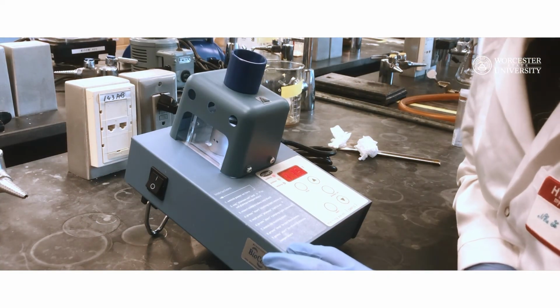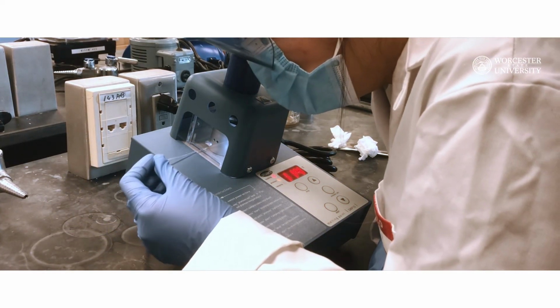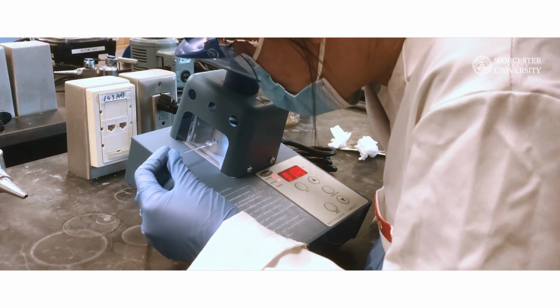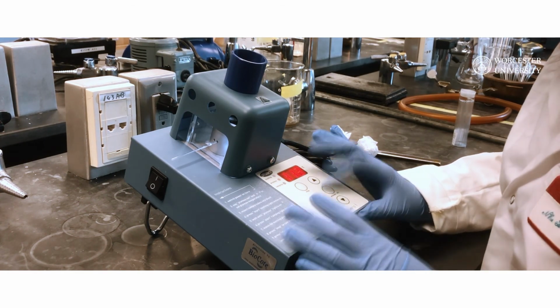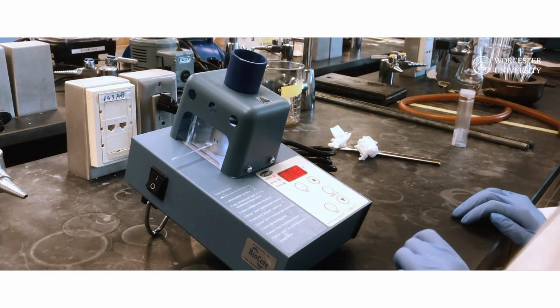After the apparatus is cooled down, we can start another run. For the second trial, we get a new, fresh solid sample in a capillary tube. Place the tube in the heating block. This time, the plateau is set at 140 degrees Celsius, which is 5 degrees below the rough melting point.